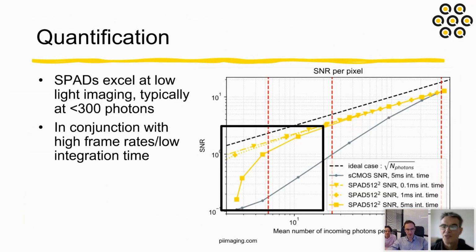Great, thank you. There's a question about why SPAD image sensors are so expensive. I made a joke about this. It's because you need to buy more of those to have a higher volume. And quite honestly, I would say that they're not more expensive than the competing technologies that are available to do this level of sensitivity and or gating or speed of acquisition. So the price of SPADs has come way, way down.